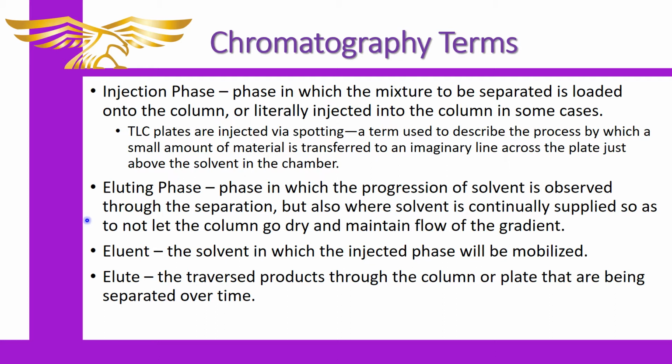In the older days of doing chromatography, everything was done by hand, so it was all gravity work, and they still do gravity columns for some things. When you do a gravity column, you have to continually apply solvent through the column by hand, or you have to have a pump hooked up to do that part, because you've got to continually supply solvent. You never let the column go dry. That's just not done, and letting it run completely dry can actually cause the column to be disrupted. You have to continually keep the media in suspension.